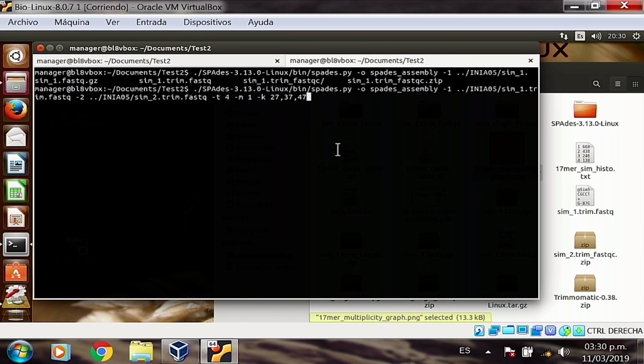All right? So once my command is ready, now I can press enter. Some of you may get errors because there might be some typos, or there might be some files that cannot be found because of a typo or because you're in the wrong directory to find them. Just be patient and remember, those are the most common errors. First, check if there are typos in the names that you're using. If there are not enough spaces, check that you're not quoting or anything like that.